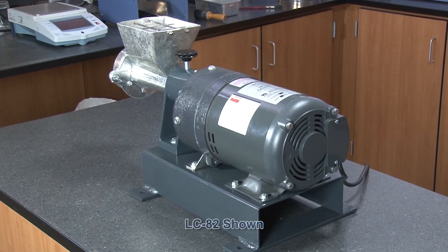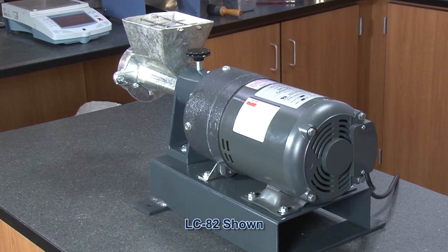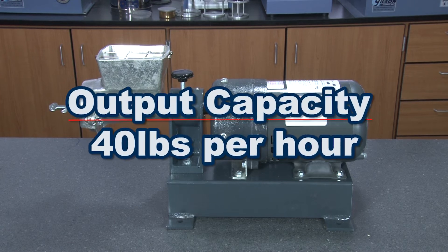Utilizing its one-third horsepower gear motor, the revolutions per minute tops out at 89 RPM and the maximum throughput capacity is 40 pounds per hour.